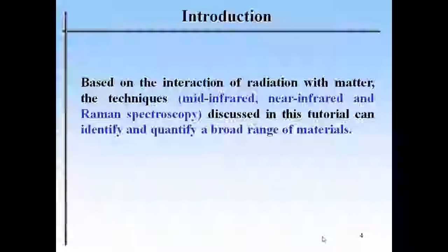Introductory remarks. Based on the interaction of radiation with matter, these three techniques I'm going to talk about, Raman, mid-infrared and near-infrared spectroscopy, can identify, discriminate, and quantify a broad range of materials. I think I'm a little bit an outlier in terms of this conference, because these techniques can really tell you, is it compound A, B, or C, and they can assign correctly the investigated material.